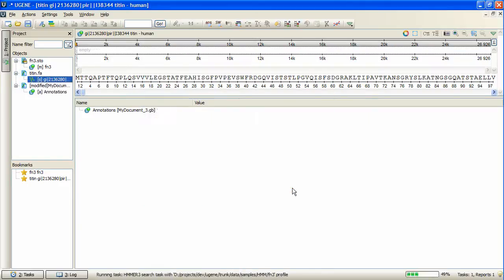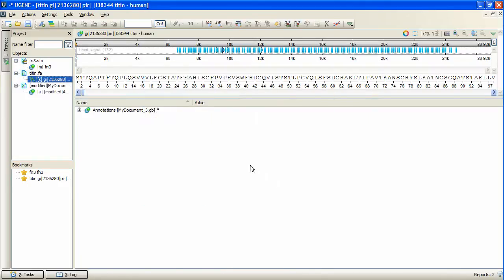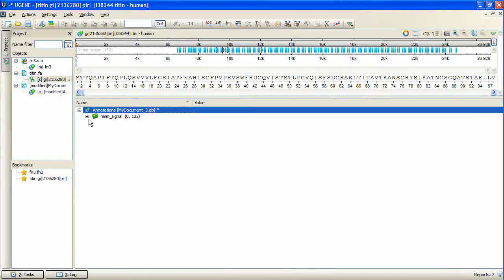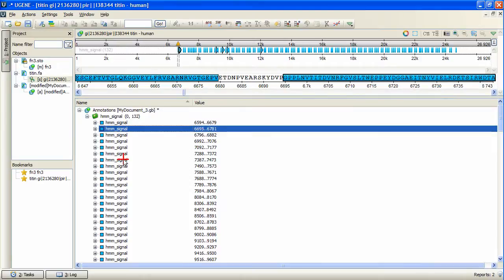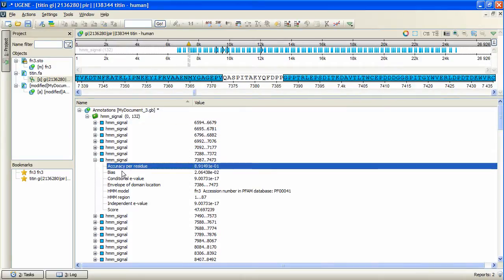The search is done and we can browse the found signals. The found annotations contain the HMM signals parameter values.